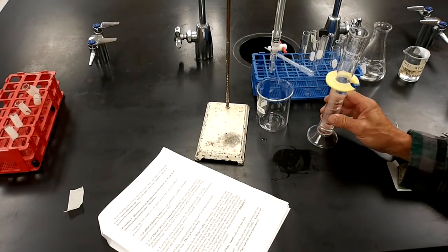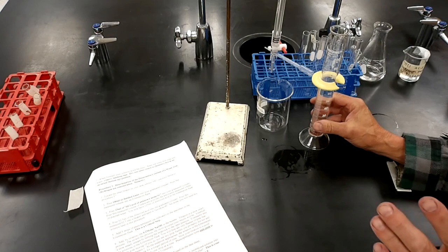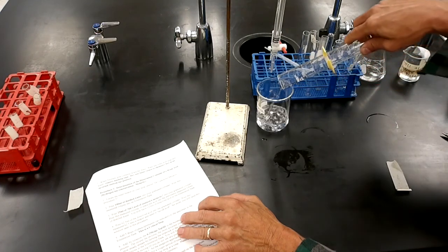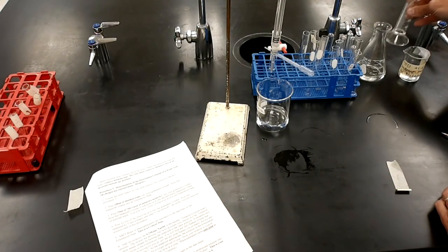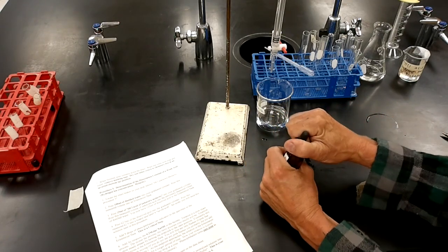All right, so this has 12.5 milliliters of that original acid. So there's 12.5 milliliters of that original acid in here. I'm going to pour that into this beaker. Set that aside.